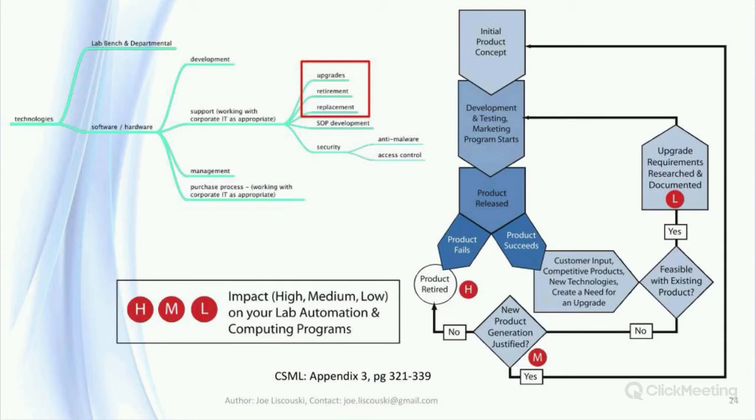So how many product versions will your lab cycle through? The possibilities of product termination or significant upgrade are a concern in technology management. Well-planned, well-designed systems can tolerate change. Inadequate planning can put you up against a wall.